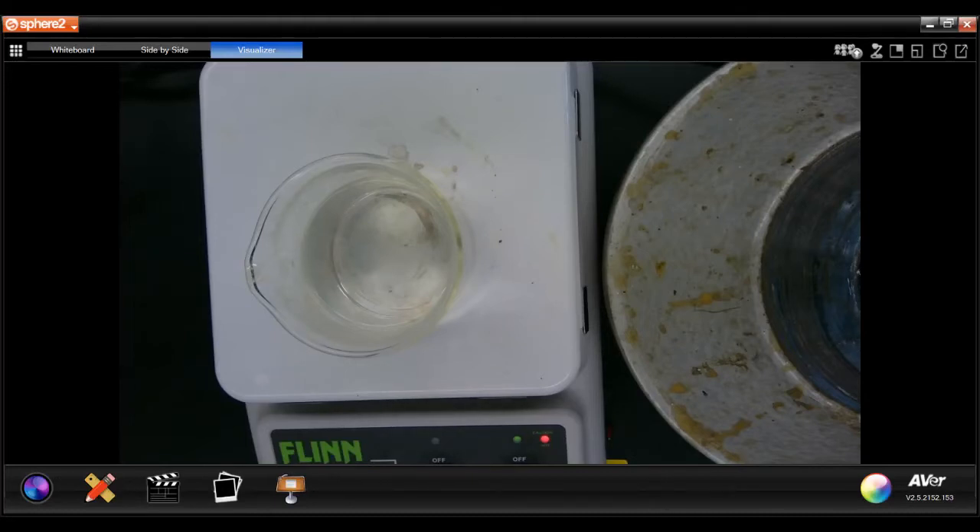Today we're going to look at the separation of iron and copper from zinc. I have the solution that was saved from procedure 1C. To that I'm going to add 6 molar sodium hydroxide.